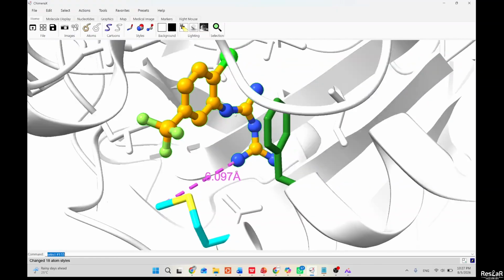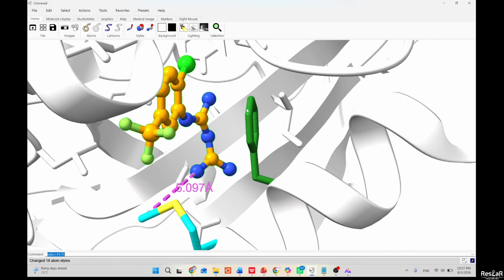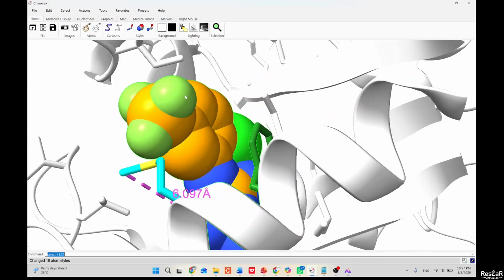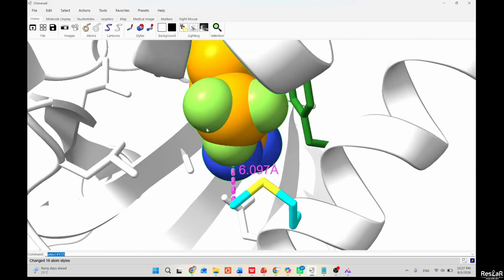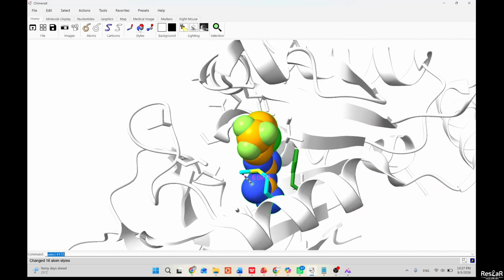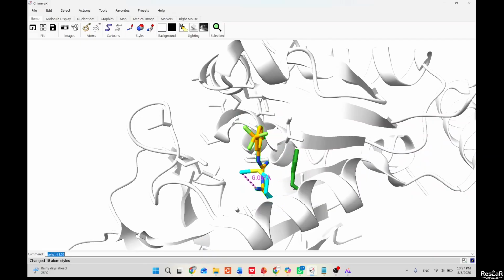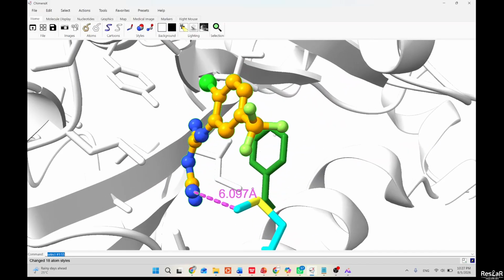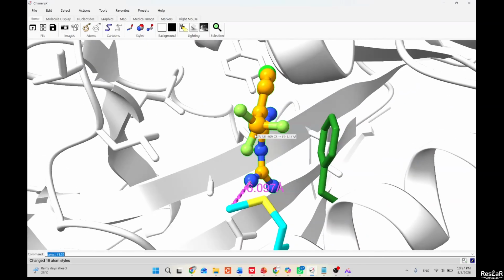This is also a ball representation of your atoms, and then you can also use space fill, I mean, van der Waals representation. These are things that are available depending on what you want. It might not be necessary, but as you work, you keep defining how you want to represent your structures or visualization.